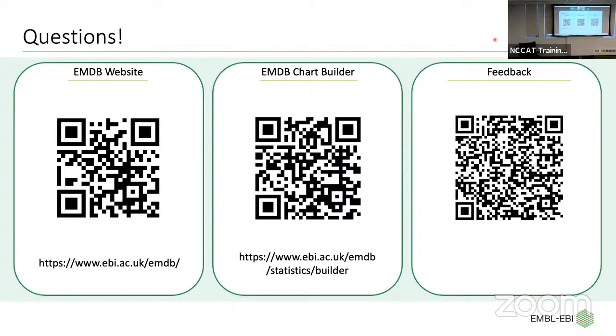So that functions. But on the other hand, if we do really want to learn something by downloading the EMPIAR data, we actually need more information. In my opinion, you need a little bit more mandatory terms when you upload to EMPIAR to make sure people can actually deal with it. So is there any plan to implement these, or can you give certain data sets some kind of label so that people can actually reproduce the same result?